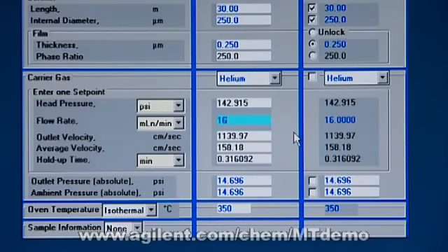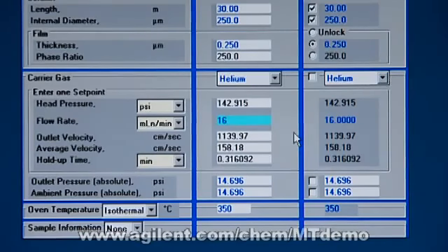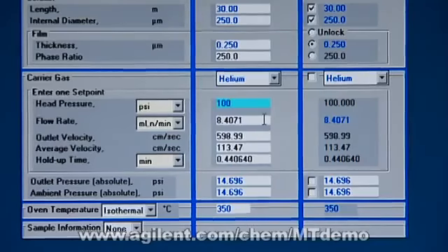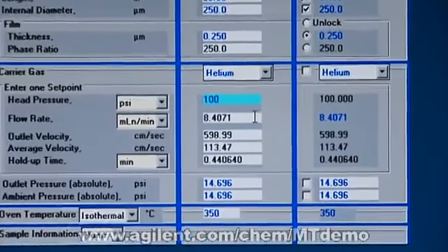You're not supposed to go higher than that. We do have a specialized EPC that goes up to 150, but if I have 100 psi inlet, I'm too high of a pressure. So I see that the maximum flow rate... Let's try that. Let's put in 100 psi and find out that our maximum flow rate that we're going to be able to use at 350 degrees is going to be 8.4 mils a minute.